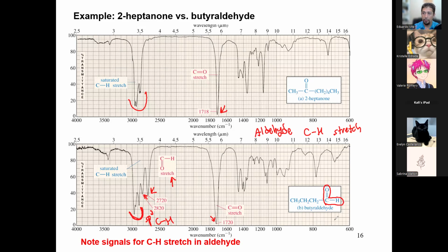Are we okay with this so far? You have to know the carbonyl. Like if you learn nothing else, please learn the carbonyl. Learn that the carbonyl is a very strong signal at 1700-ish. Okay? Okay, next slide.